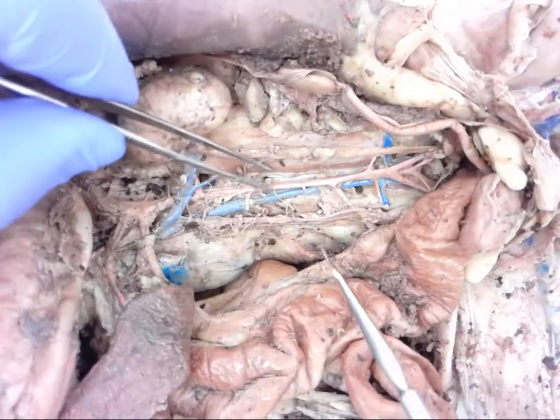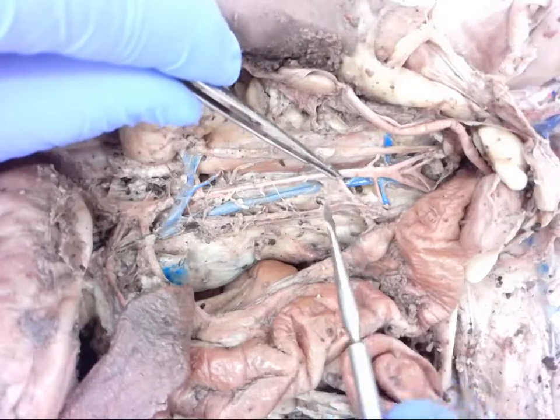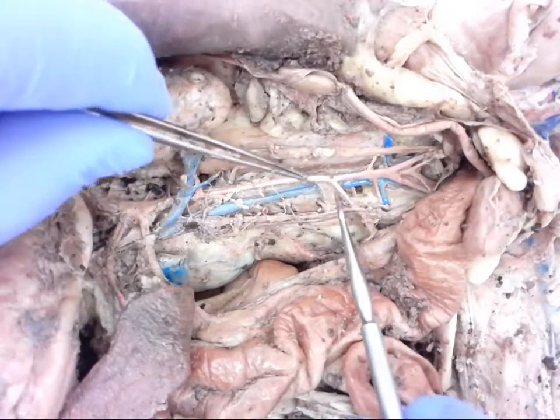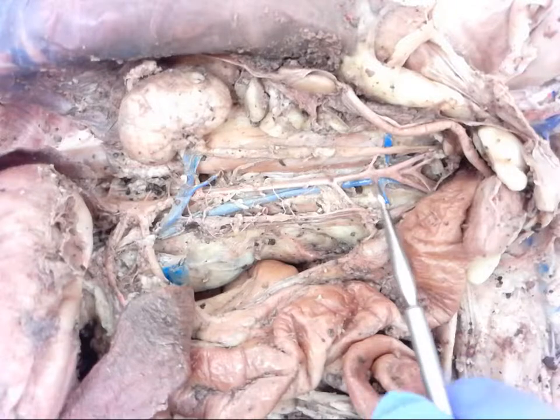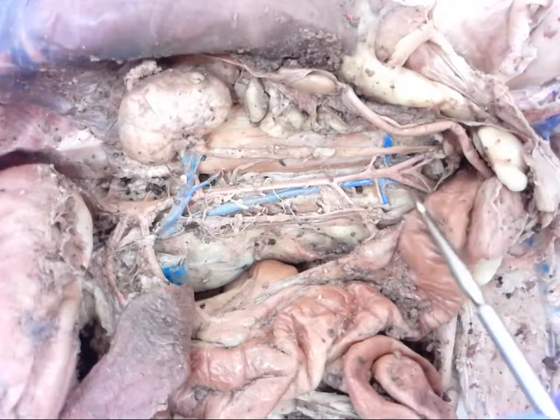So, as we continue down the abdominal aorta, then we have the inferior mesenteric, and you'll see that it goes off to the large intestine. All right, and then we have a couple of branches, our last branches, off of the abdominal aorta before it splits. These are the iliolumbar arteries.